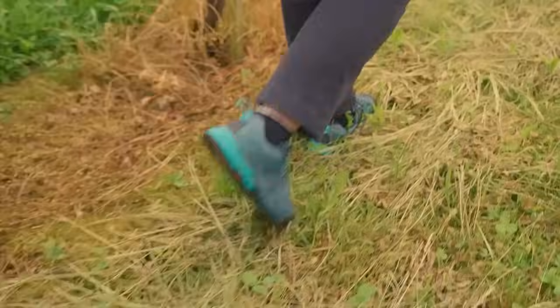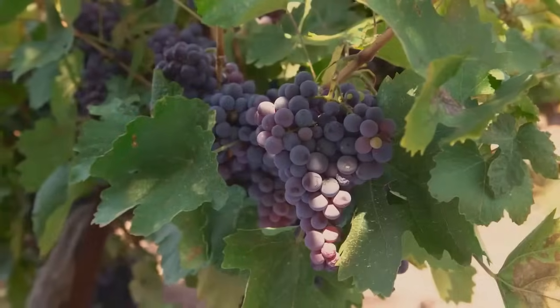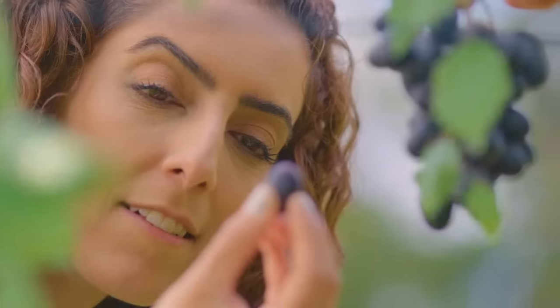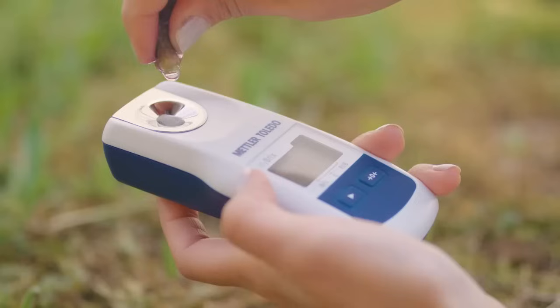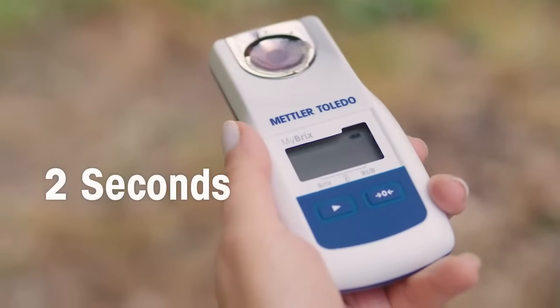Wherever you go, whatever you harvest, analyze the sugar content of your sample in virtually any environment. In a blink of an eye, you have your results.